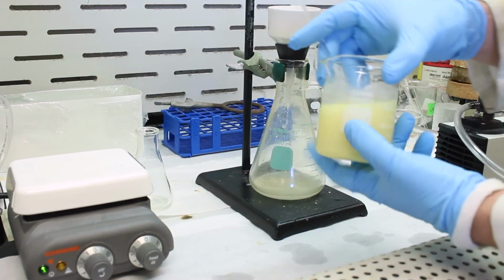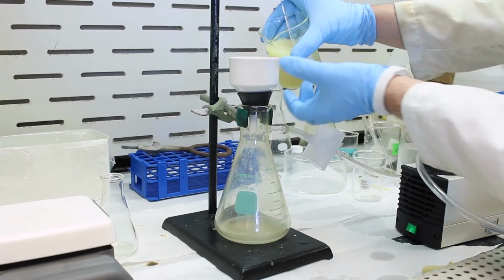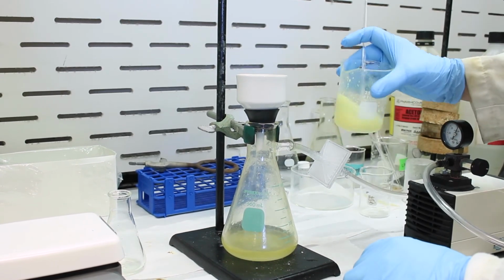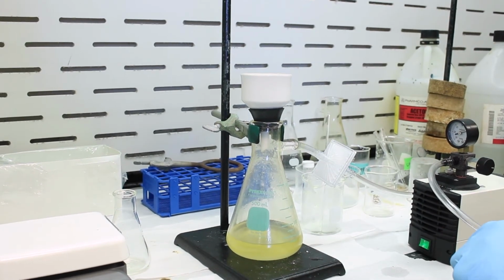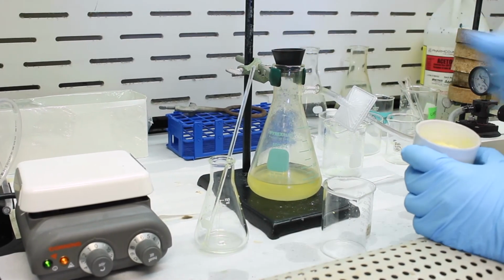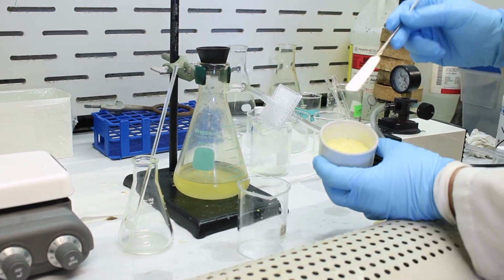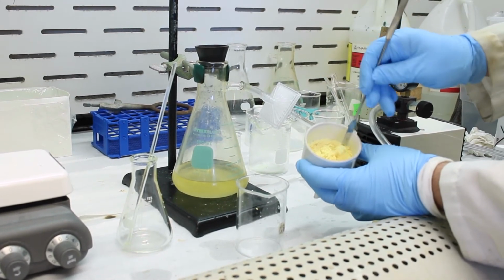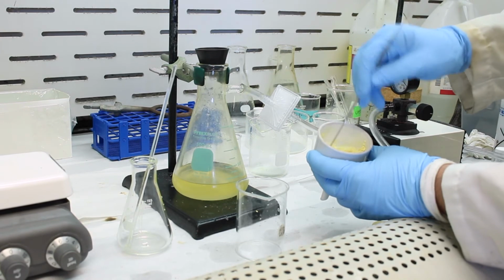Okay, so we've let it stir for a few minutes and most of it has precipitated. So now we're going to take this precipitate and we're going to filter it. Okay, so we've let it dry on the filter for a few minutes, and now we're going to scrape it into this beaker here. So before we isolate it, we're going to recrystallize this product to make sure it's pure. So we're going to scrape, scrape, scrape. You can see it looks like there's quite a bit, so hopefully that's good. We did scale up the reaction, so we're expecting a few grams is our product here.